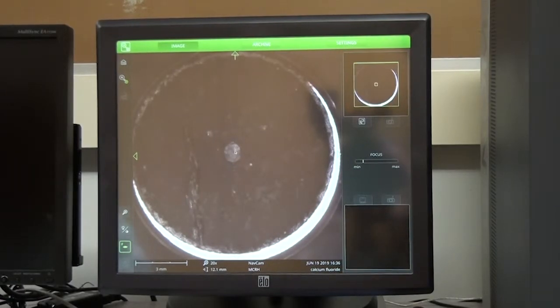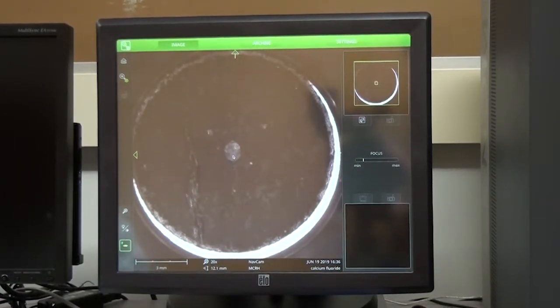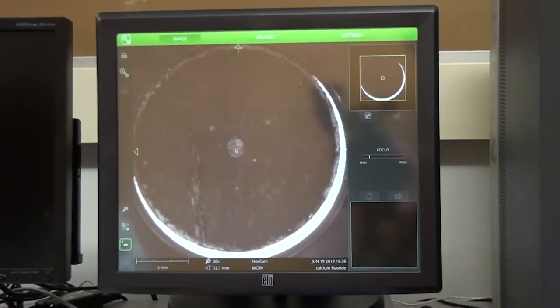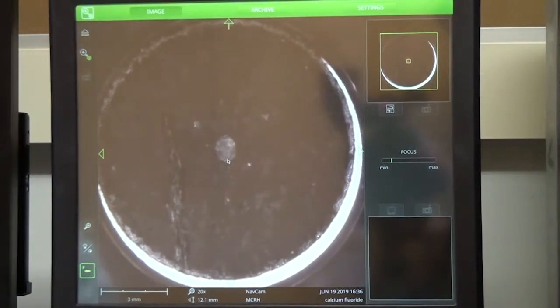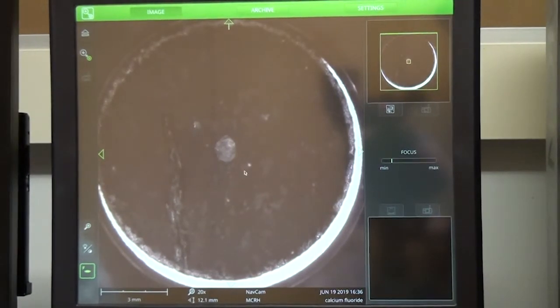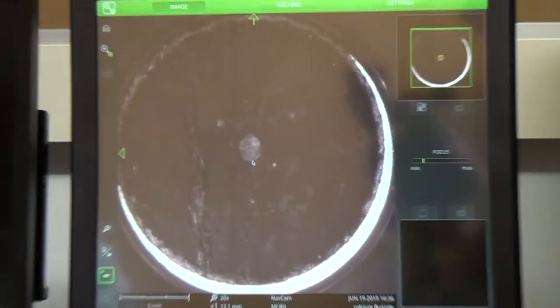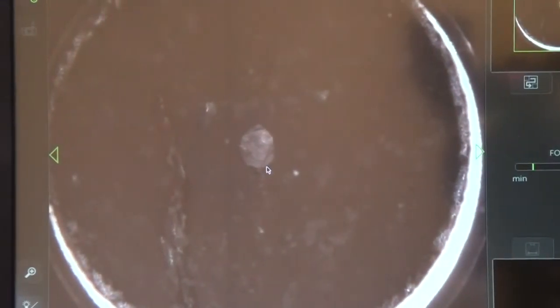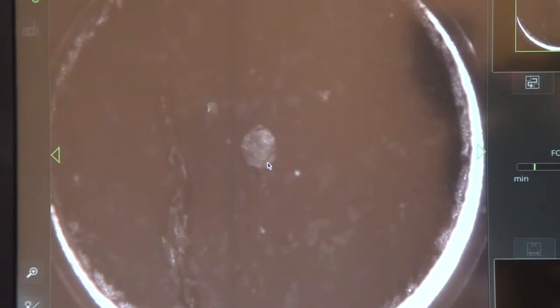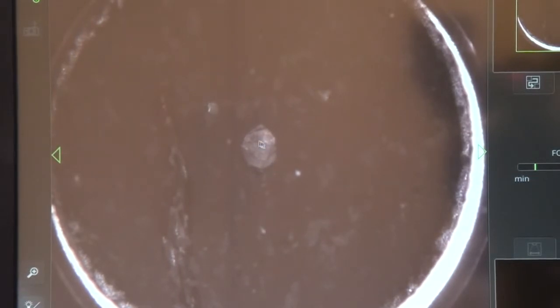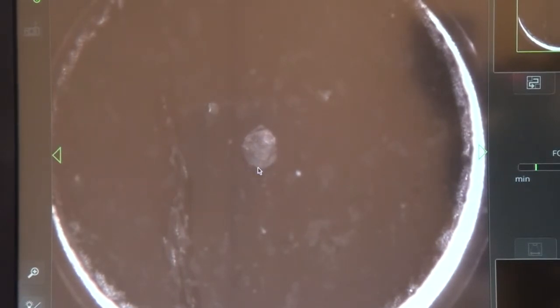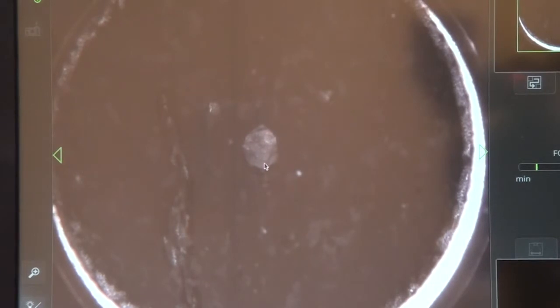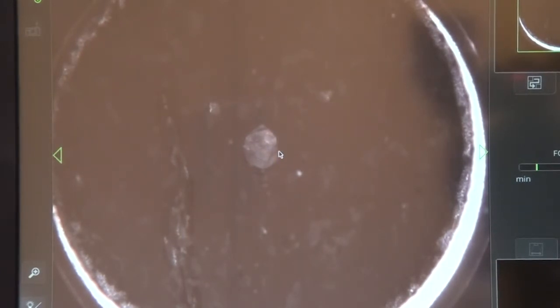The SEM first takes a low magnification photo of the sample, and the optical image is what we see first on the screen. So this is the sample of calcium fluoride, which is derived from mineral fluoride. It is widely used in laser optics due to its unique optical properties.